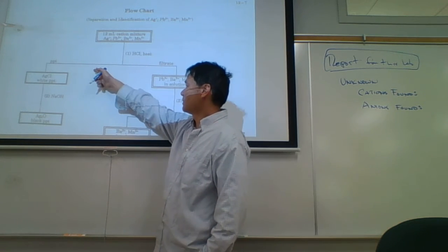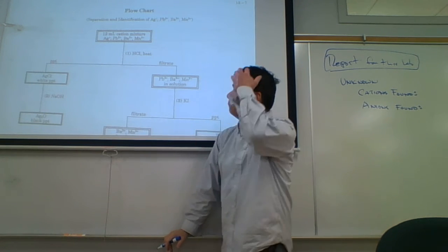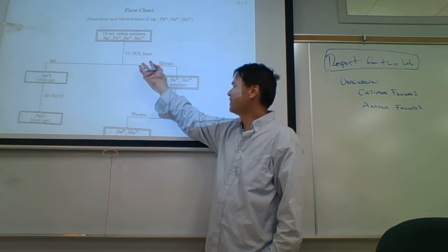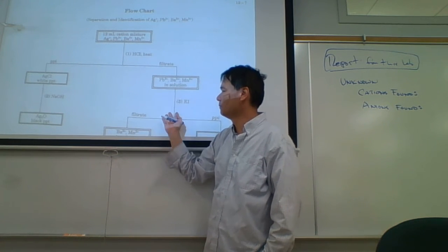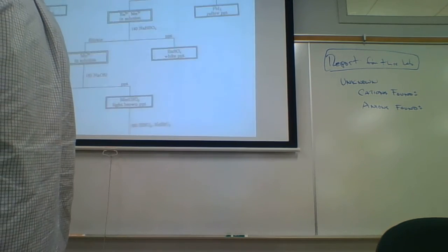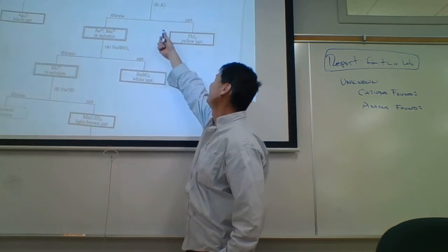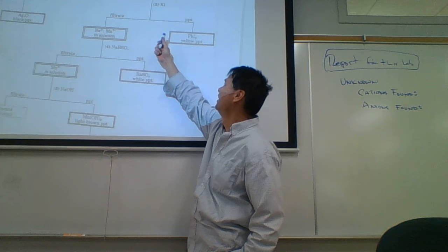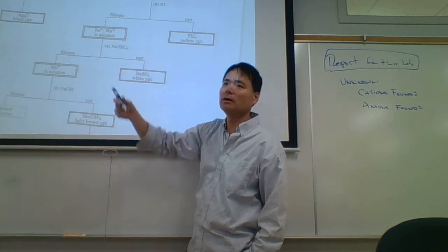And so if we did get a precipitate, great, let's see what happens with that precipitate here. But if you did get a precipitate here and you tested positive for silver, there could be other cations in the unknown. So we're going to test for the other cations here. The same thing holds as we go down the list. Here you may or may not get a precipitate. If you get a precipitate and it's yellow, that's positive for lead. But if you didn't get a precipitate, then what do you do? You just move on.